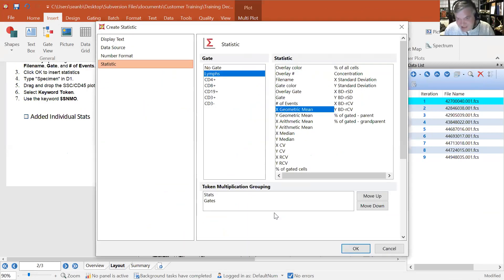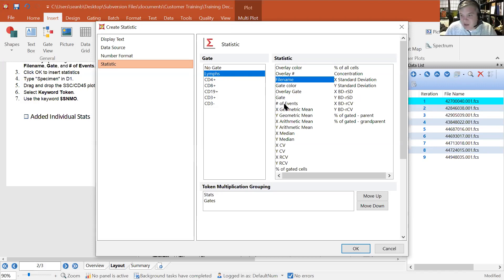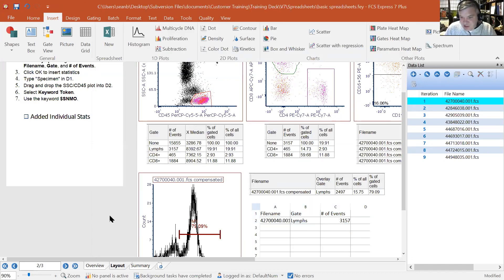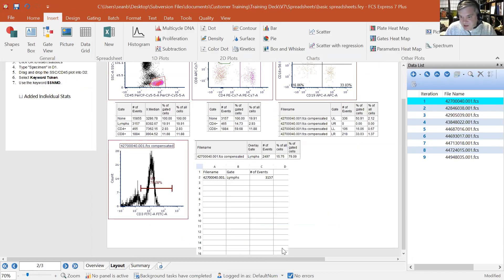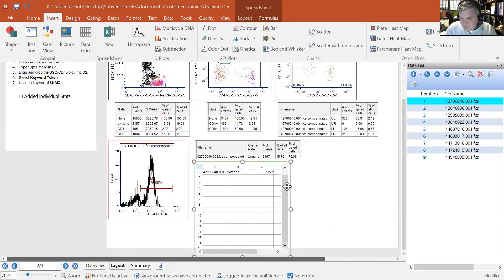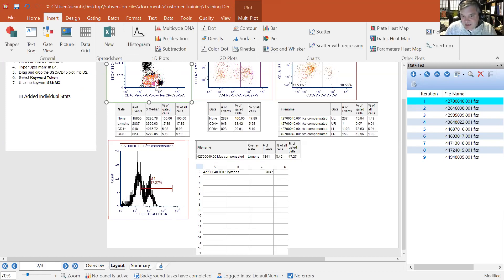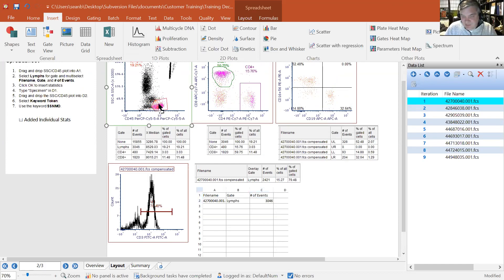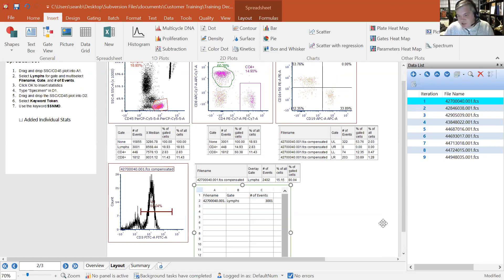I dragged and dropped the gate into the spreadsheet. For the lymphocytes gate, I selected — holding down the Control key to multi-select — the file name, gate name, and number of events. When I click OK, the spreadsheet fills in with the file name, the gate this information comes from, and the statistics directly linked to that gate. As I move the lymphocytes gate, the statistics in the spreadsheet update in real time.